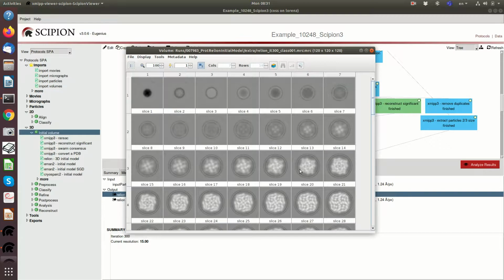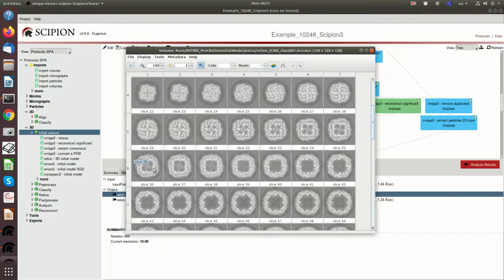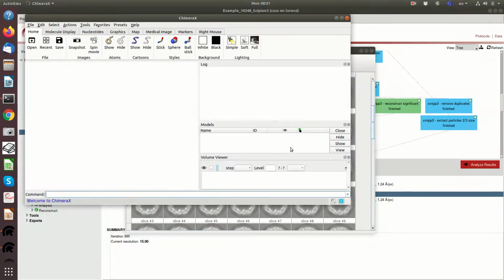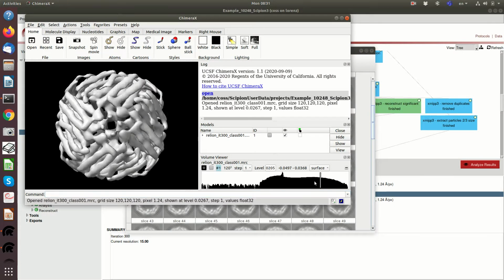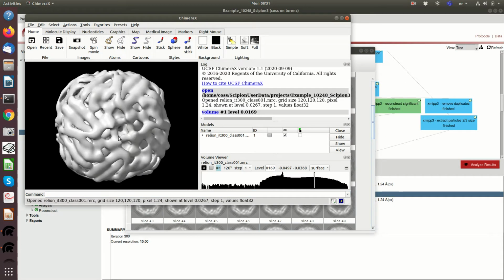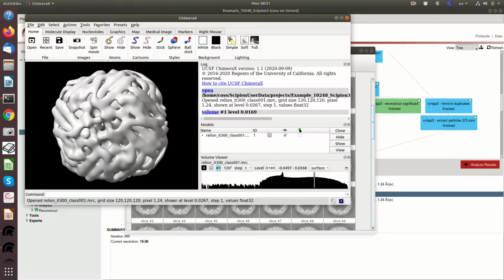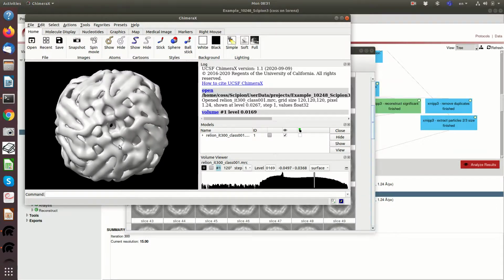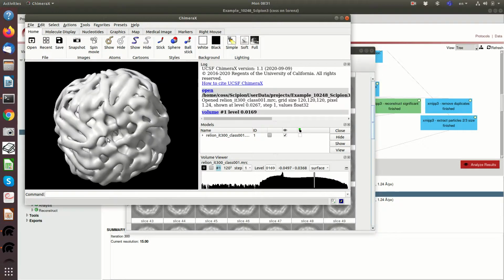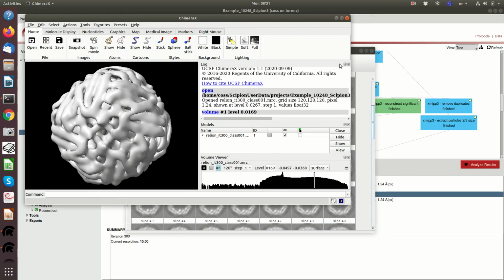And then for instance, this is Ransac, this is the Relion initial volume. For Relion we have something that looks a bit better, so at least it has high frequency details. Apoferritin has these 4 squares, or this square with 4 corners, and this is something that we should look at to see if we can find it or not.